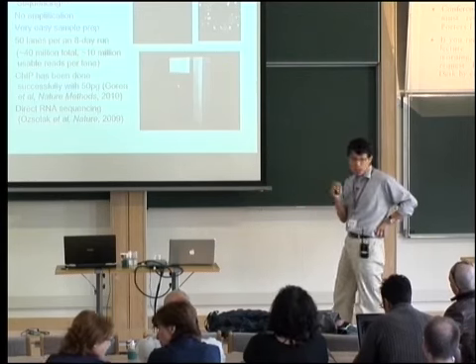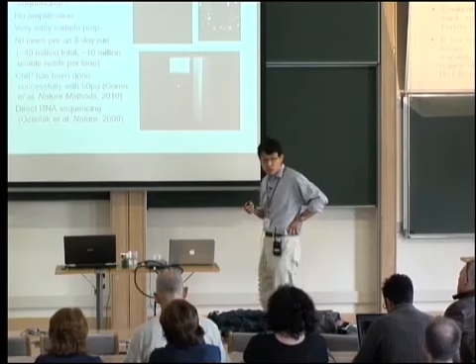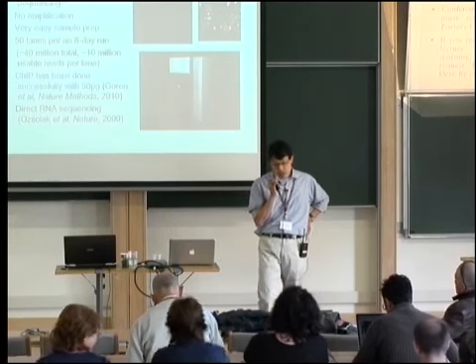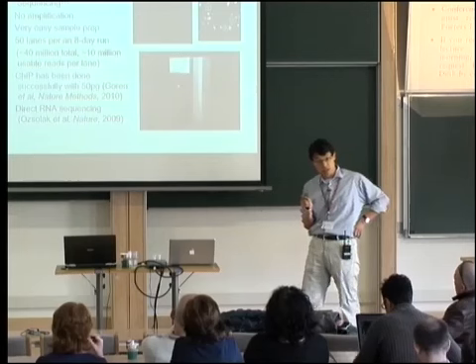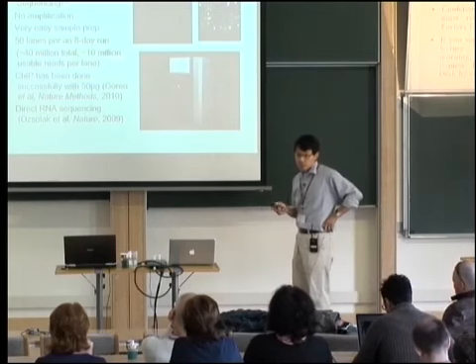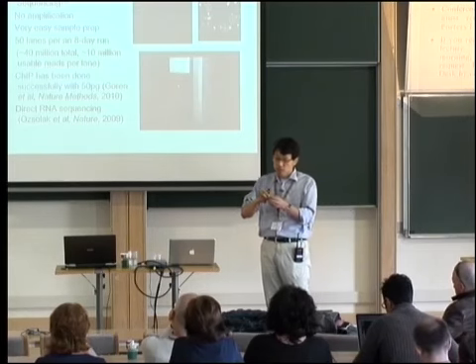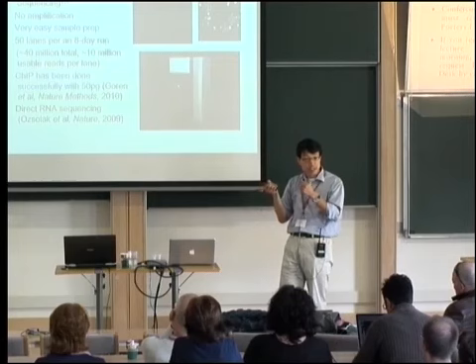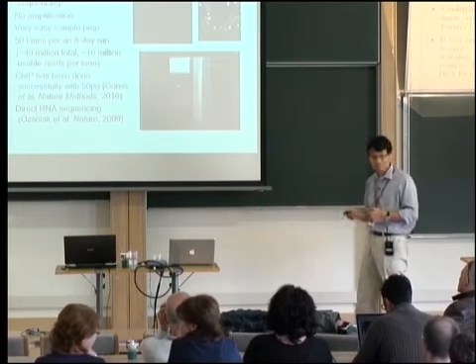So this is a single molecule sequencing. There's no amplification. Okay? So that means that we don't have to worry about artifacts from amplification. So when we profile the same biological sample on Illumina and Helicos, we in fact see some differences, presumably due to amplification. Okay? Very easy sample prep. There's no library here to construct. The way the sequencing works is that you have these poly T things stuck on the flow cell, and you just put poly A on your samples, and that's it. So postdocs love this, right?